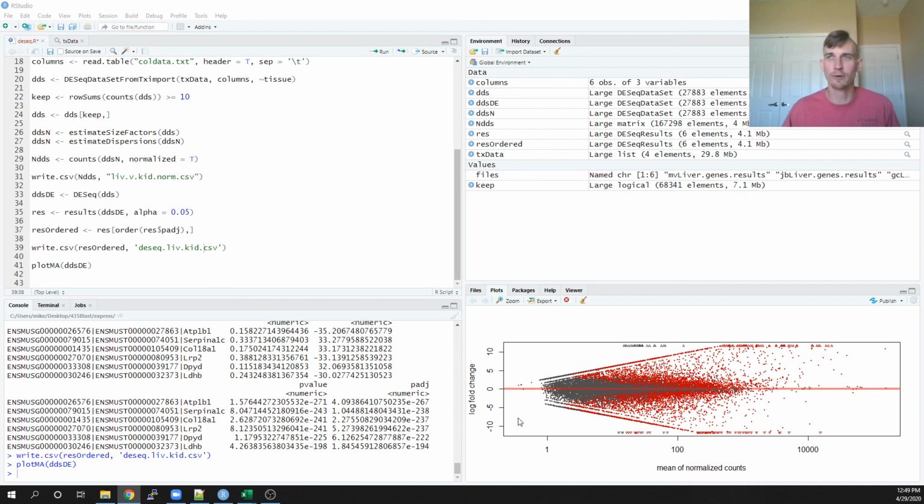So, for example, if we were going back to our fatty acid diet mice, maybe there are genes that are higher expressed in the kidney that are better at processing lipids or storing lipids. Who knows? But when we have thousands of different genes, it's kind of hard to identify and figure out which gene is doing what.